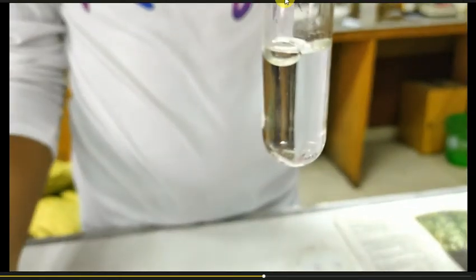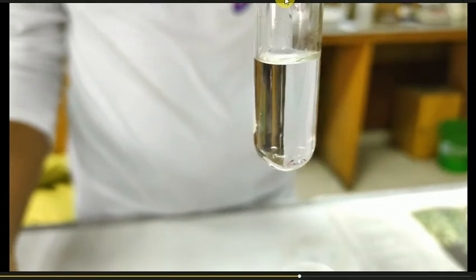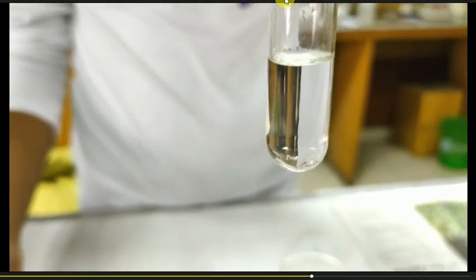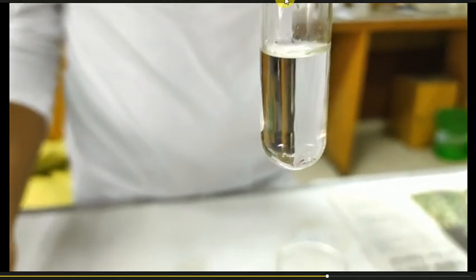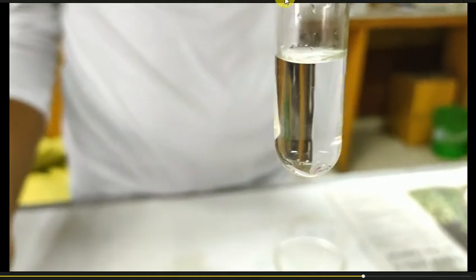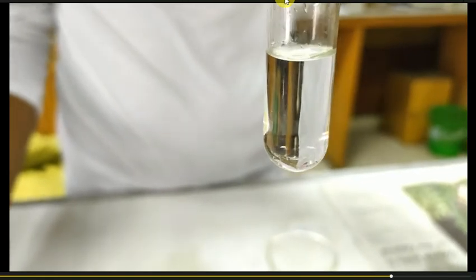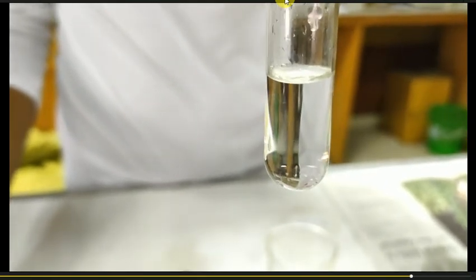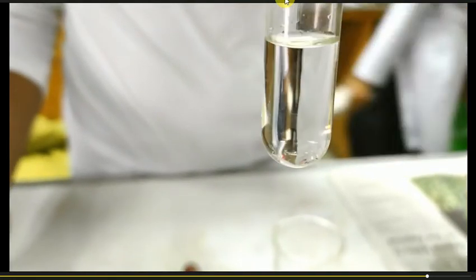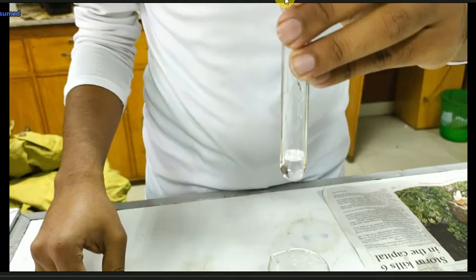The PPT dissolves. This is indicative of the presence of zinc ion. Remember that the PPT didn't dissolve in the case of aluminium when ammonium hydroxide was added, but in the case of zinc ion, the PPT formed by the ammonium hydroxide dissolves when excess ammonia is added. This is indicative of the presence of zinc ion.